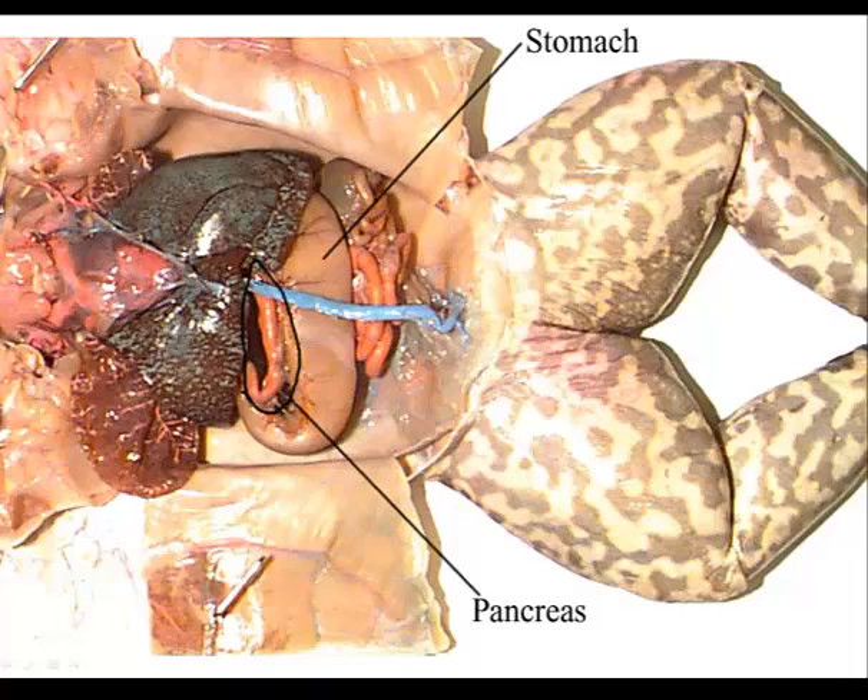When we look underneath the liver, we'll find the stomach. Go back to the frog's mouth with the probe and insert it down into the esophagus to see where it travels from the mouth into the stomach. The opening between the esophagus and the stomach is called the cardiac sphincter. Food is digested in the stomach, and when ready, passed out through the pyloric sphincter into the duodenum of the small intestines.